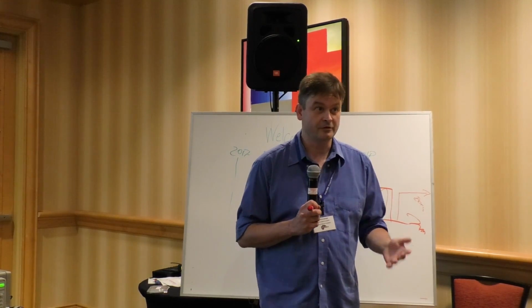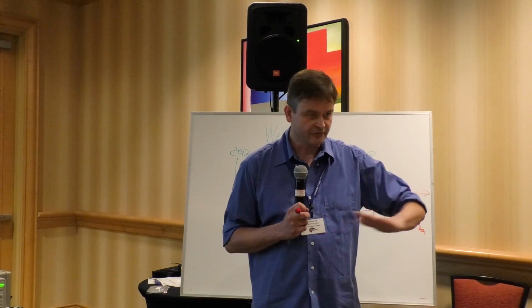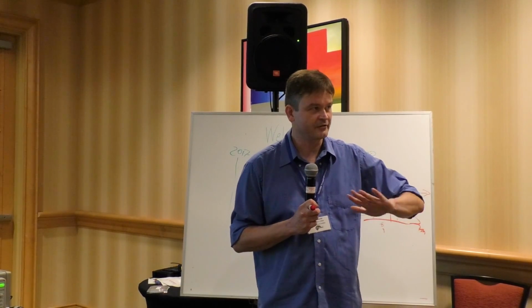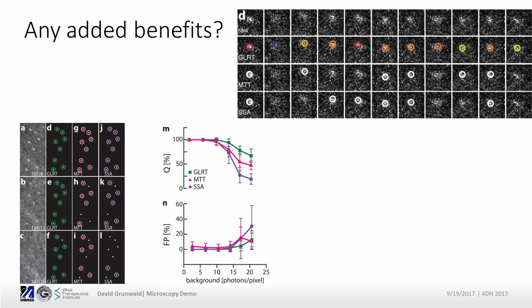It'd be really nice if we could tell our computer, hey, 2 sigma, 3 sigma, this is my sort of comfort level, that's how certain I want to be. At that level I want to count. So, yeah, you can do that. And what sort of benefits does it give you?